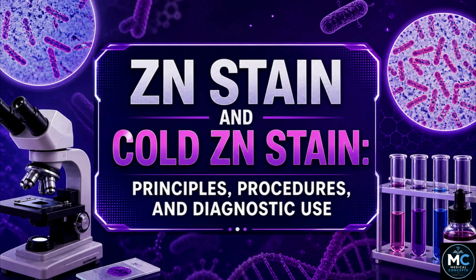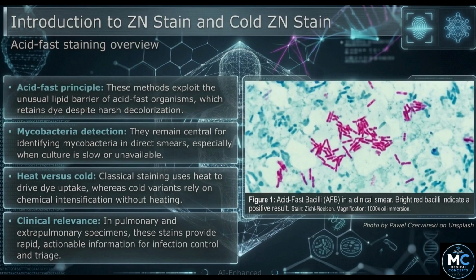Good morning, everyone. Today I will be discussing Ziehl-Neelsen staining and cold ZN staining, focusing on their principles, procedures, and diagnostic applications. These techniques are used to identify acid-fast organisms, especially Mycobacterium species. Ziehl-Neelsen and cold variants are foundational acid-fast methods for detecting mycobacteria in routine microbiology workflows.